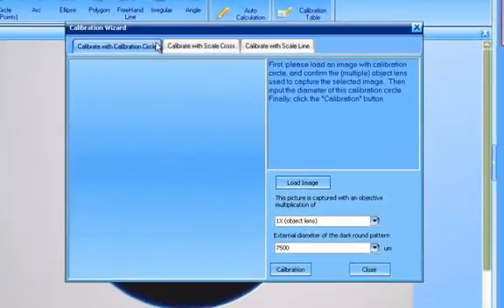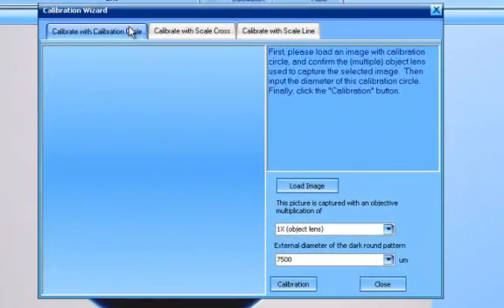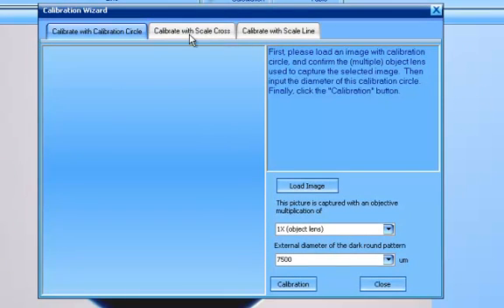The instructions are already there. With the calibration wizard you can use it to calibrate the calibration circle, scale cross or scale line. But we're going to use the calibration circle.